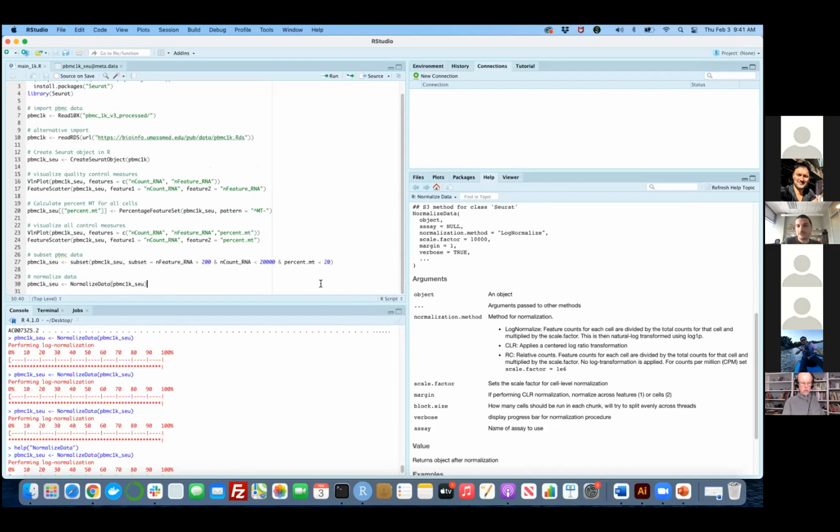Some gene may look like you have 40 counts in one cell, but 20 UMI counts for the same gene in another cell, so it may look like that gene has a higher expression, but in reality it's based on the total UMI. It has nothing to do with higher expression. So that's why we're normalizing by the total UMI count before we move on. All right, thank you.